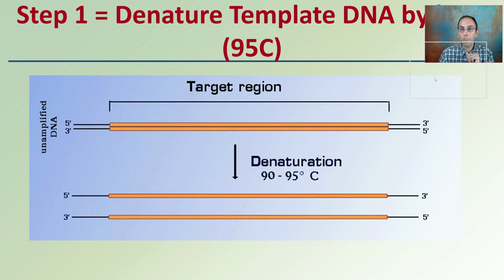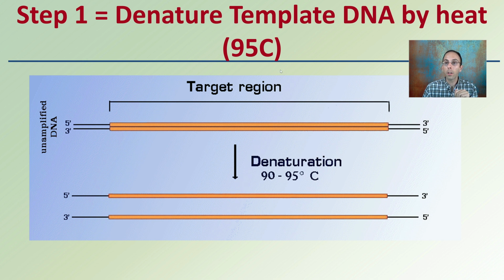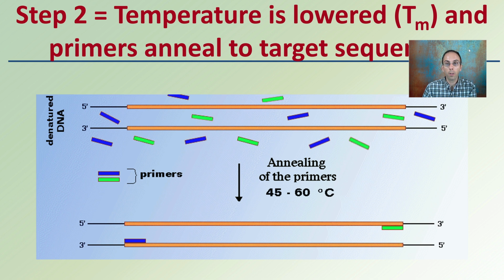Now, that first part that I mentioned is the denaturation of the template strand DNA by heat at 95 degrees. We're taking our double-stranded DNA and heating it up so it's denatured and separated. It could be 90 to 95 degrees Celsius, depending on the specific region, on the presence of A to T bonds or G to C bonds and the percentage of those.